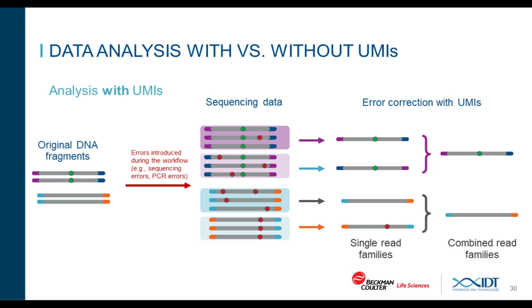What are typical yields after extraction from a tube of blood, for example, 4 milliliters of plasma? This is Shilpa, and I can take this one. cfDNA concentrations actually vary significantly. They can range from 1 nanogram to 100 nanograms per milliliter of plasma. But the concentration typically seen for cfDNA for healthy donors is usually between 1 to 15 nanograms per milliliter of plasma.